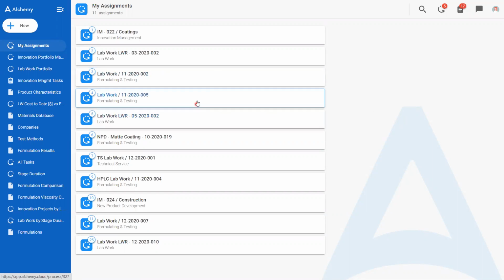What we're going to talk about today is what the heck is Alchemy and how can I navigate myself around this amazing lab tool? So just as a quick orientation, maybe we'll start from the top right-hand corner and work our way over. In the top right-hand corner, you can see that we're logged in as a user. In this case, this is Beth Cooper, right? That would be associated with anyone working inside of your lab or your organization.